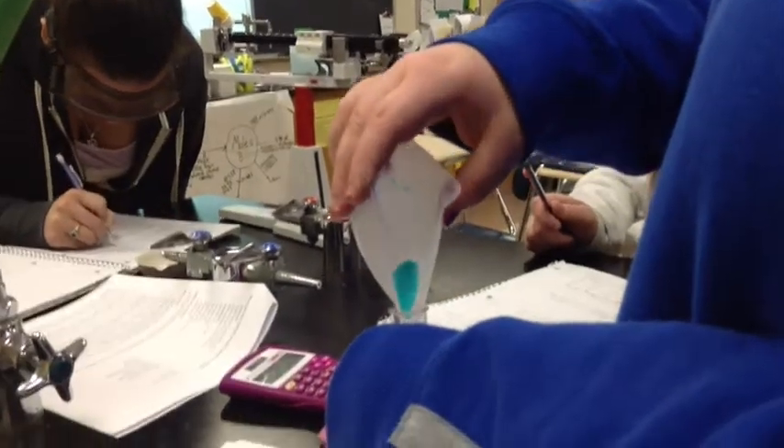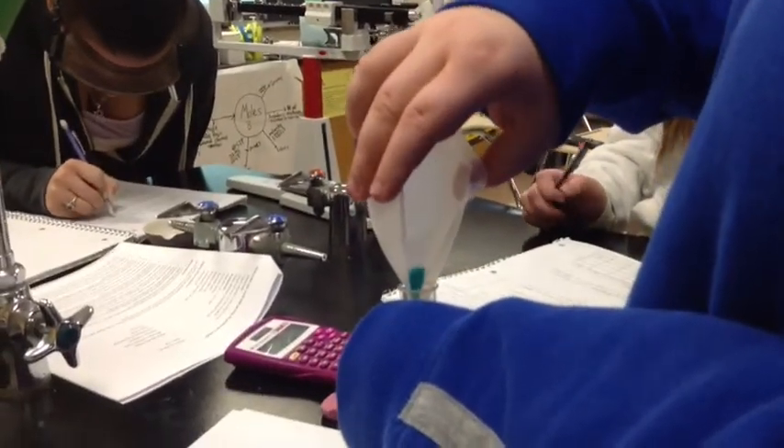We are running the reaction between copper chloride dihydrate and aluminum wire. There goes the solid copper chloride into the test tube. And we've got our aluminum wire — plain old — over here. There's the before.